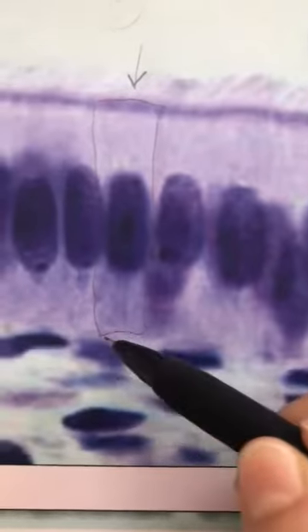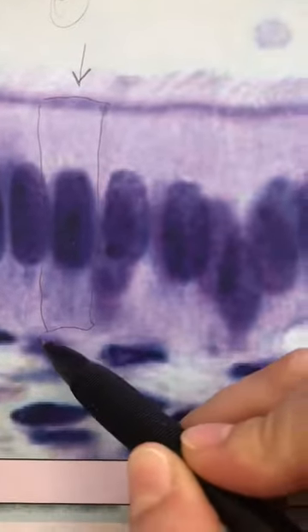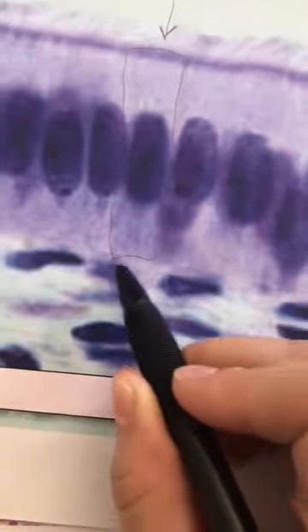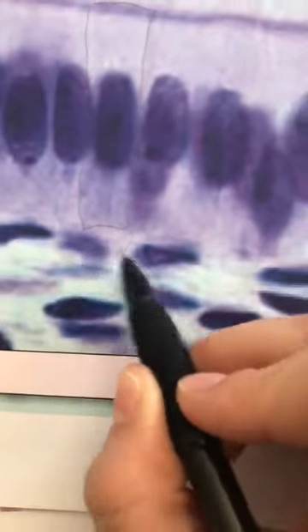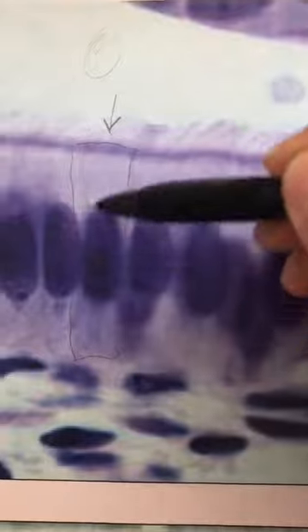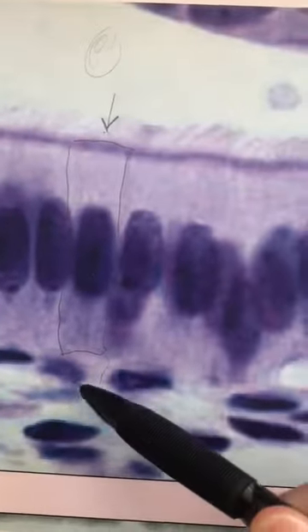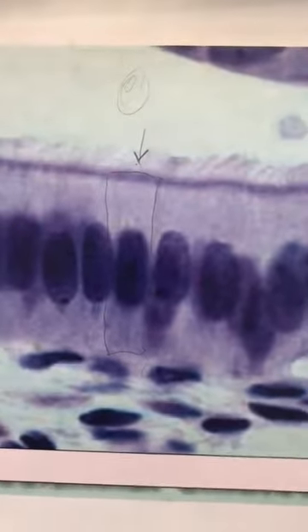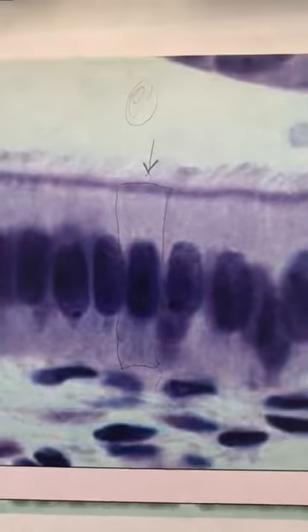And then our last question, step 3, is: is it on top of another row that looks a little similar to this? My answer here is no. Okay, so I don't have any of those extra rows down there. So by looking at this tissue and going through each of those 3 steps, finding my apical surface, identifying the type of cell that touches the apical surface, and whether or not it has another layer of it underneath, I come up with simple columnar epithelial tissue in this picture.